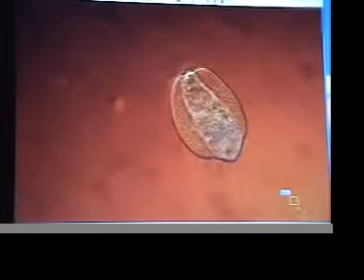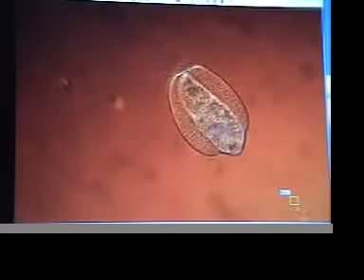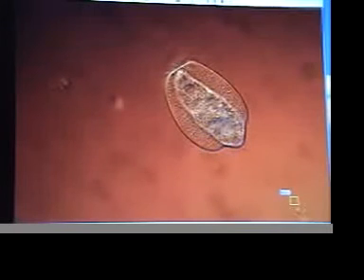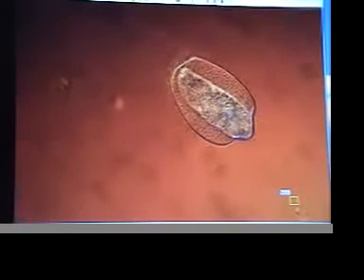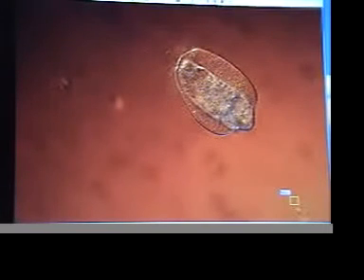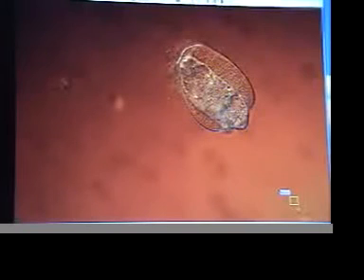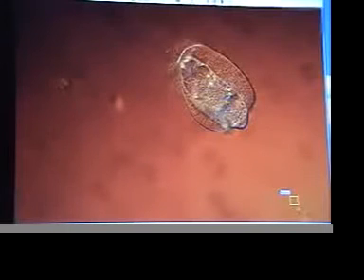Looking at them under the Nomarski filter, I don't see any cilia action. This is just like before. And these little jerky movements are usually indicative of a morphological transformation. Current frequency is 1187 hertz. 1187 plus the 11th harmonic.